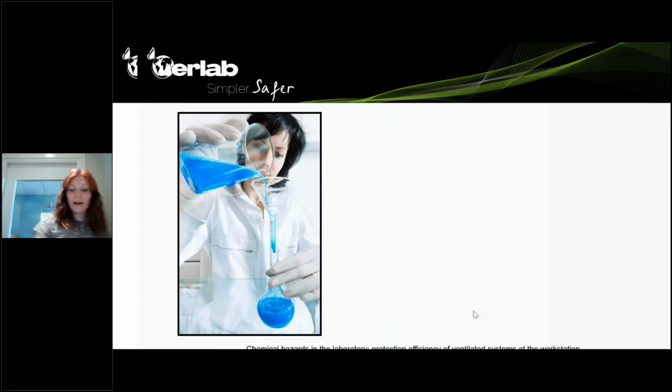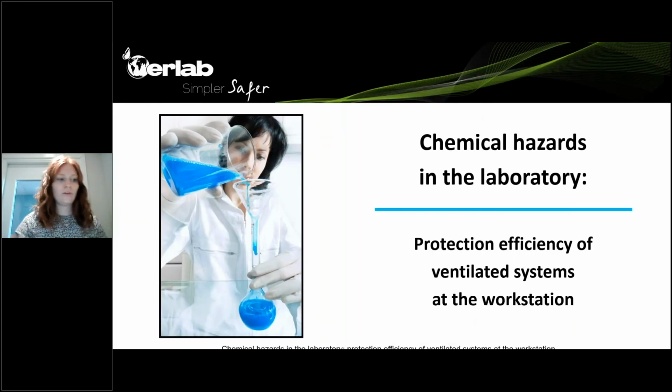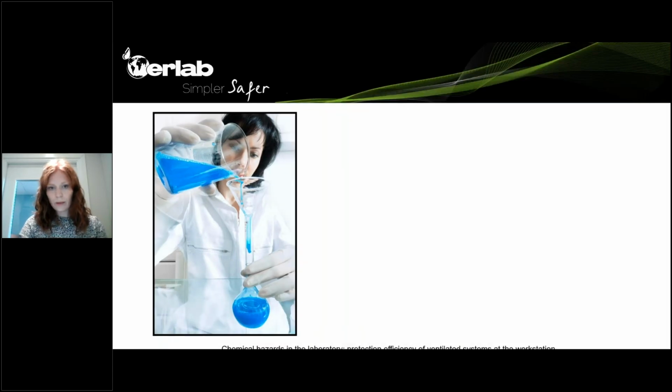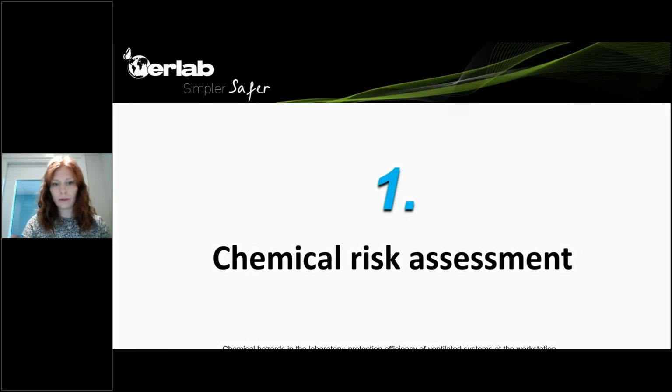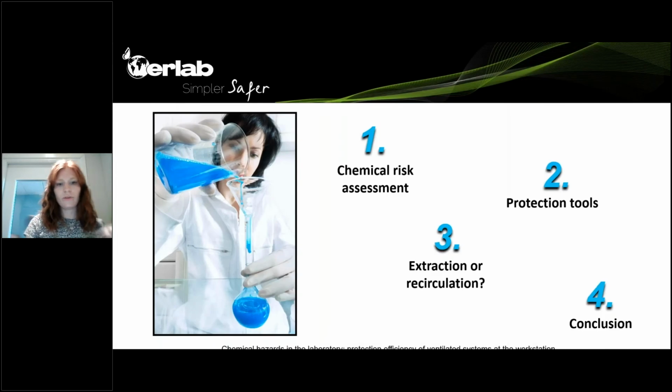Okay, so as I was saying, today we're going to talk about the chemical risk in the laboratory and see the different tools that laboratory personnel have to get protected from the inhalation risk. We're going to start with seeing how to proceed to the risk assessment.